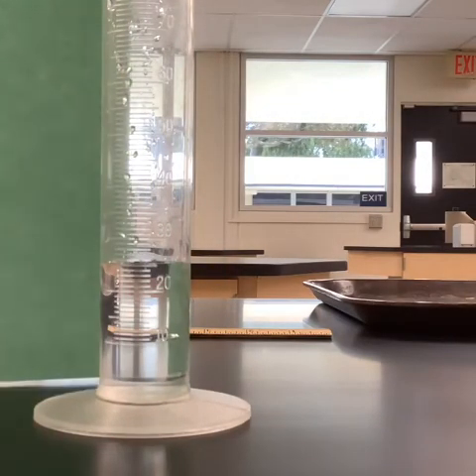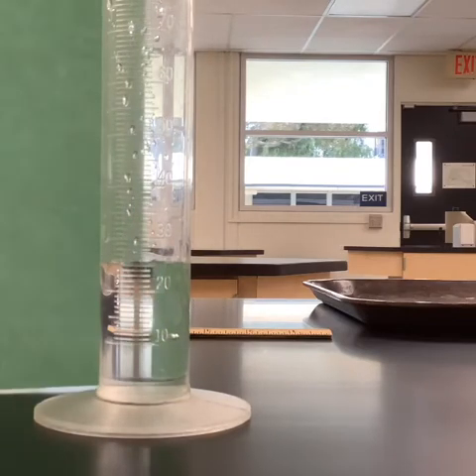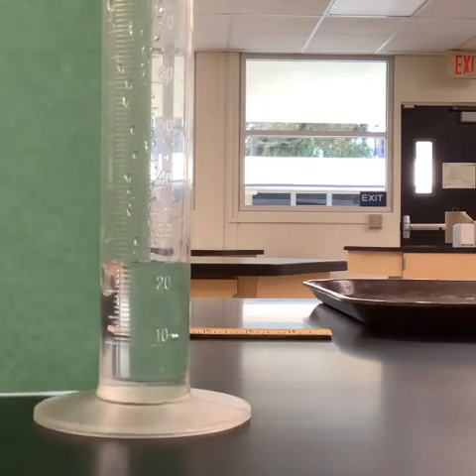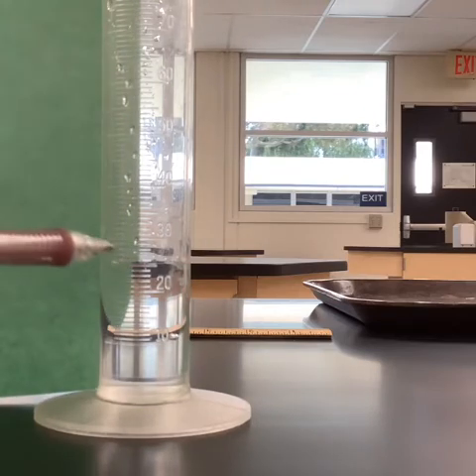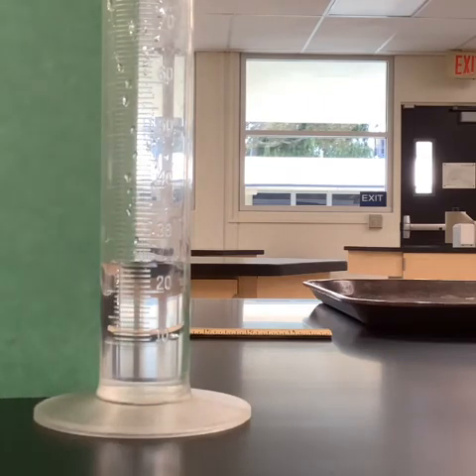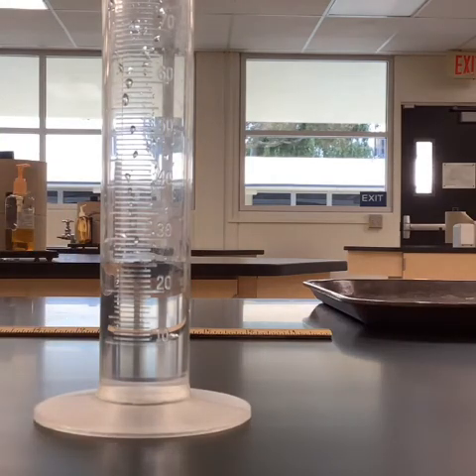And so let's go ahead and make our best estimate as to what the volume is right now. What would that volume be? So we can see there's a number 20 right here, there's a number 30 up here, and we've got all of those lines that are kind of popping with the light a little bit, and we can see where that level is. It's right about there. So record the volume of what's in our graduated cylinder.